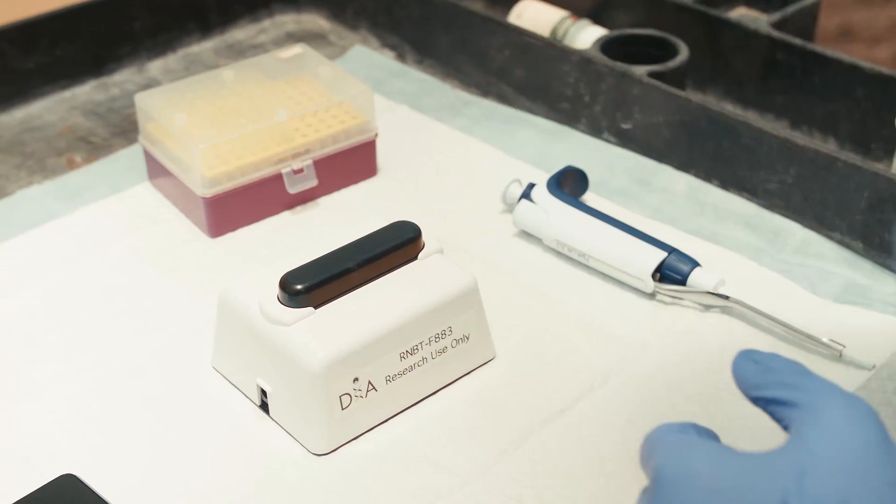Support our campaign and the idea that everyone should have access to critical research tools like the SmartDart. Thank you for your time, and please share our campaign.